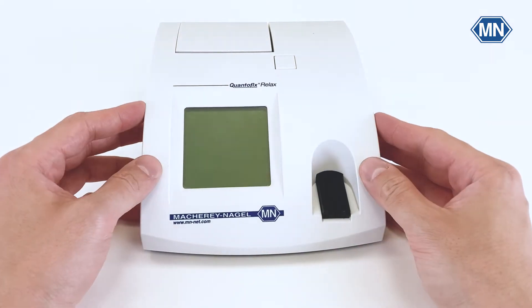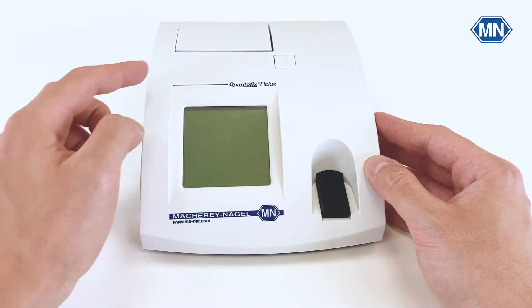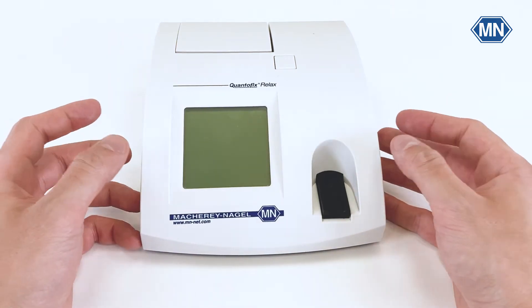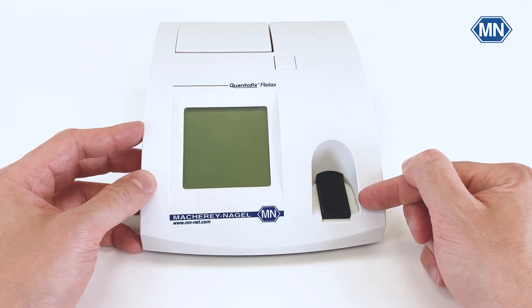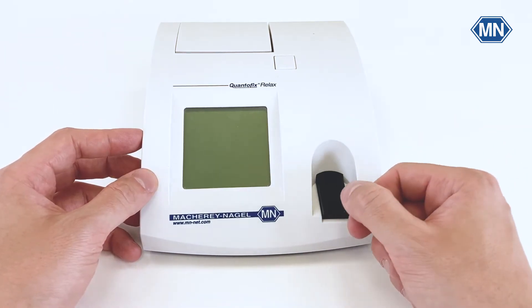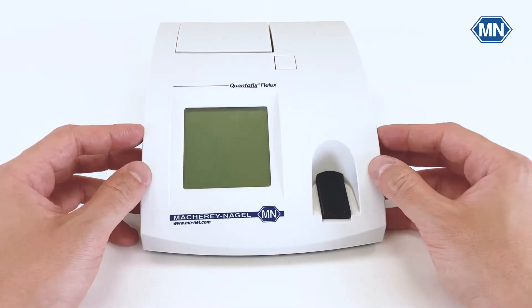Now let's take a closer look at the Quantofix Relax. The device and all of its features can be controlled via this monochromatic touch screen. Once the device is switched on, it will automatically move out the test strip slider. Afterwards, you can just place the test strip on it and it will automatically move the test strip in and analyze it for you.